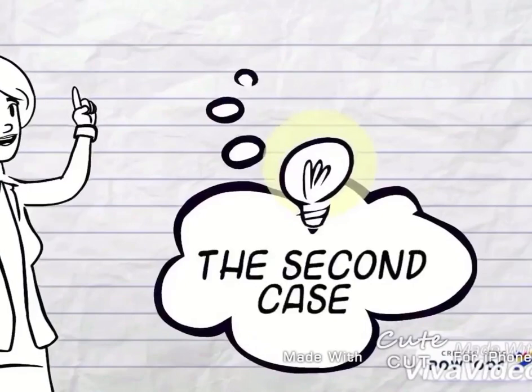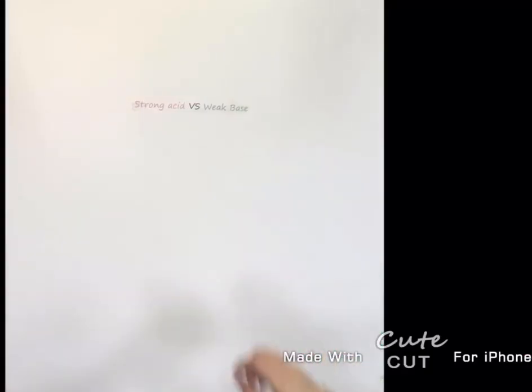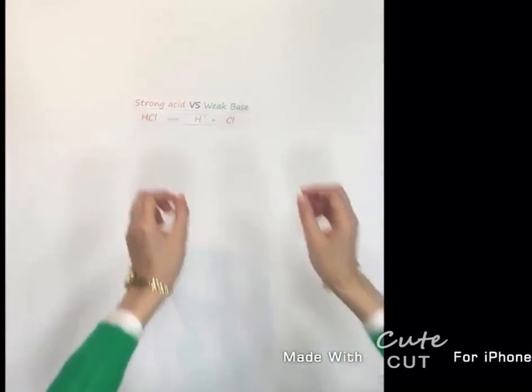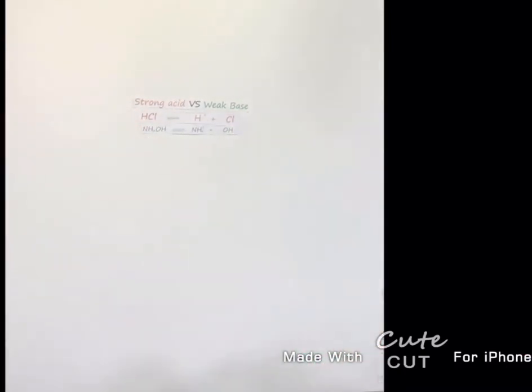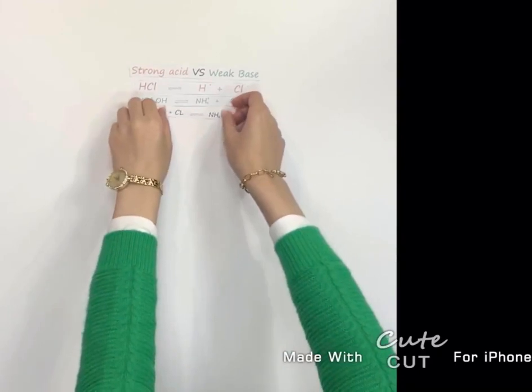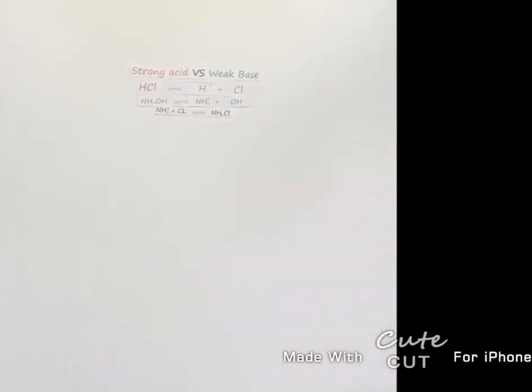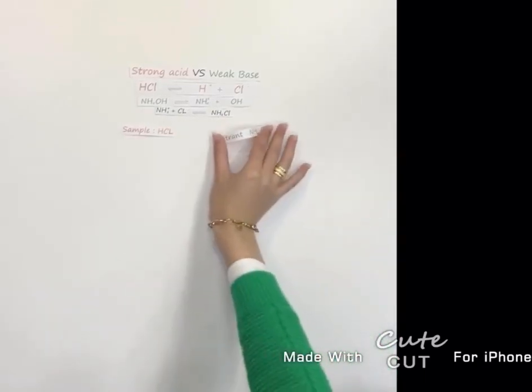The second case is strong acid against weak base. The strong acid is hydrochloric acid, which is completely ionized. And the weak base is ammonium hydroxide, which is incompletely ionized. Due to the presence of free ammonium ions and free chloride ions, ammonium chloride salt will be formed. The sample will be hydrochloric acid, and the titrant is ammonium hydroxide.